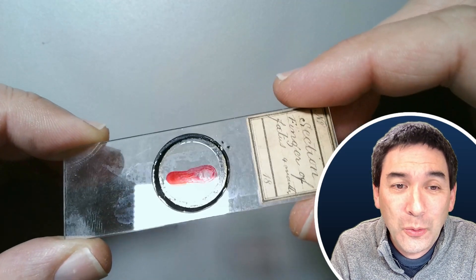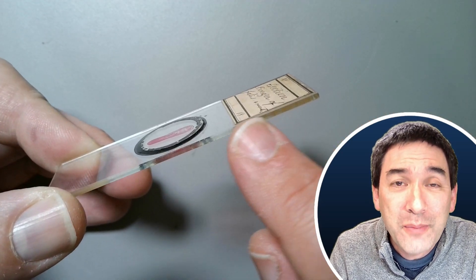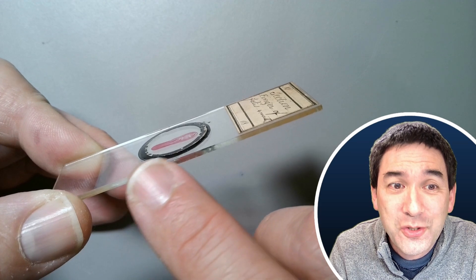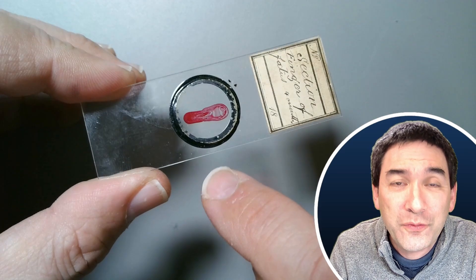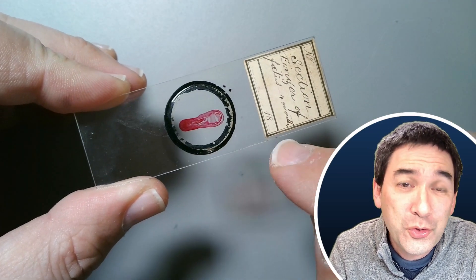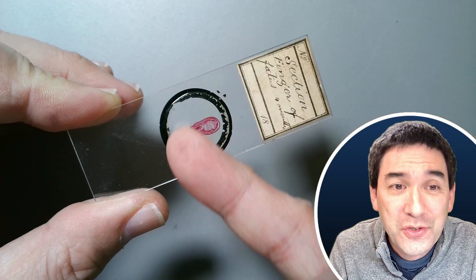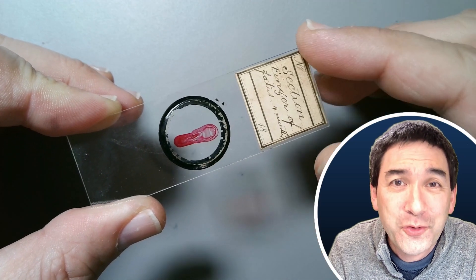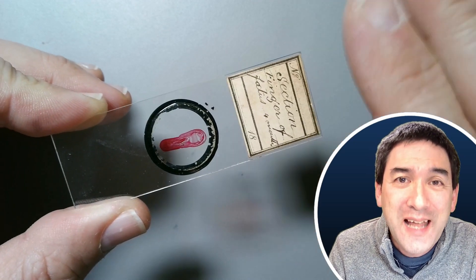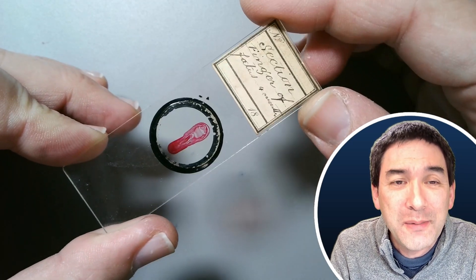If you just hold it, you can feel it's quite heavy. The slide is also relatively thick — much thicker than modern microscope slides — and it's also polished, so the quality is quite nice. The cross section of the finger was mounted, though unfortunately I don't know in which mounting medium. It was also ringed quite nicely, though the paint has come off a little bit, which shows the slide was stacked on top of other slides. But I'm quite happy I was able to obtain this specimen.